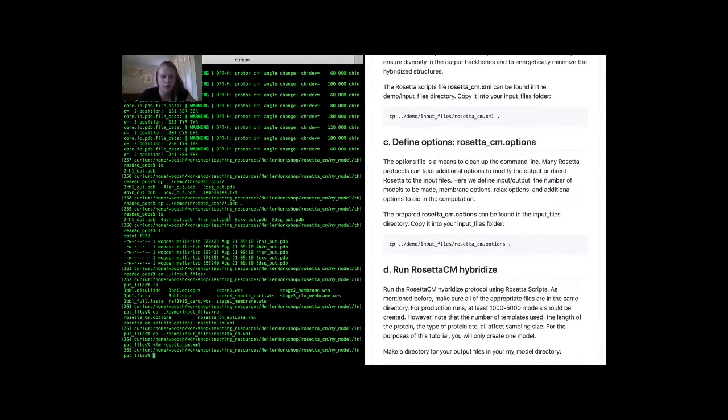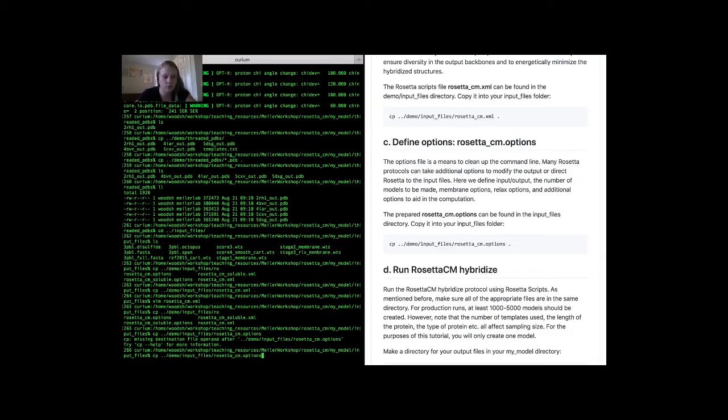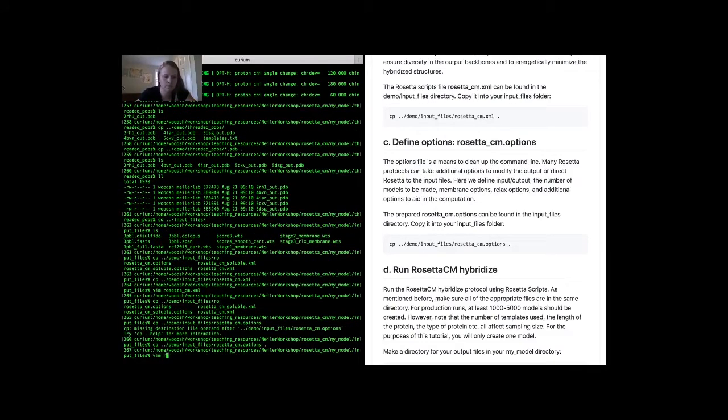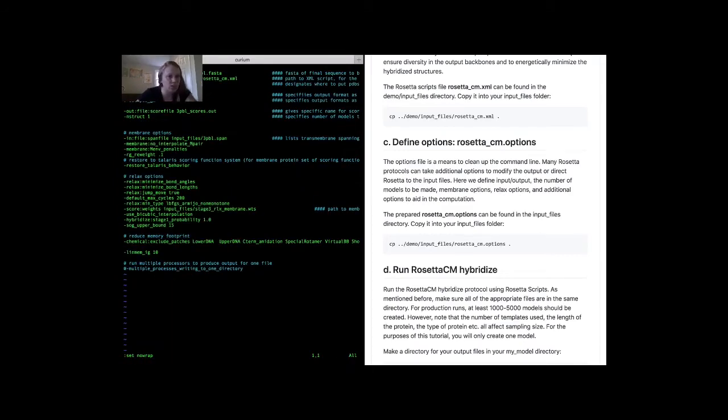Now we're going to want to copy over our options file. All right, so this is our options file.